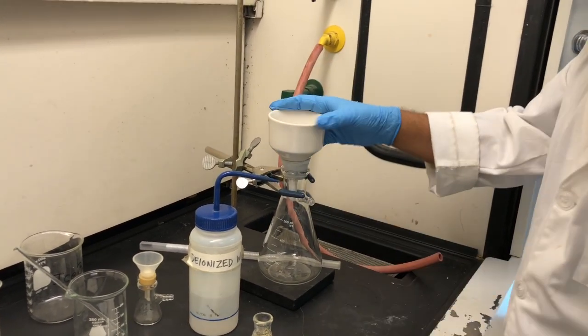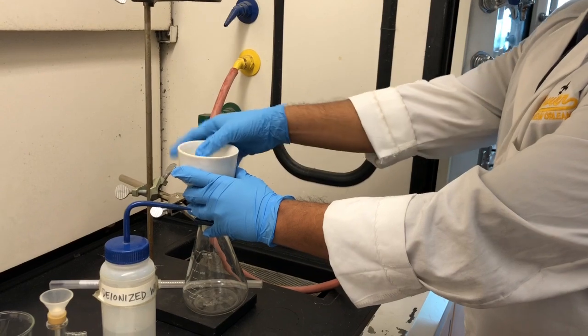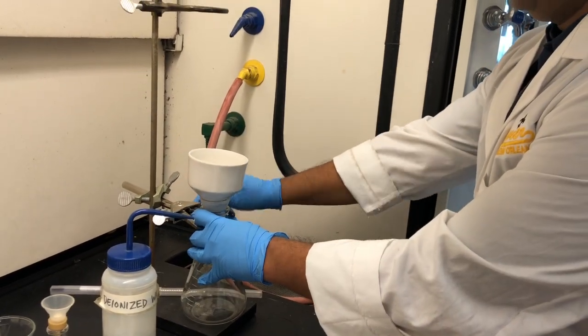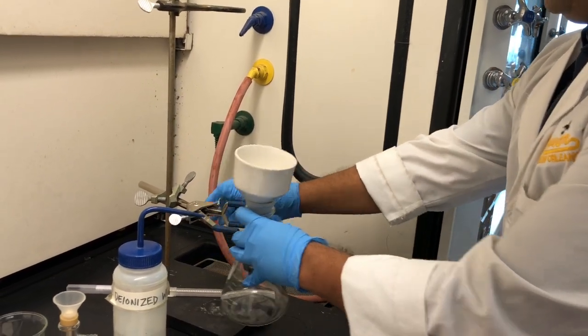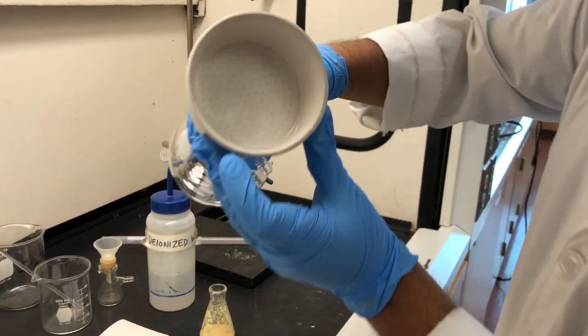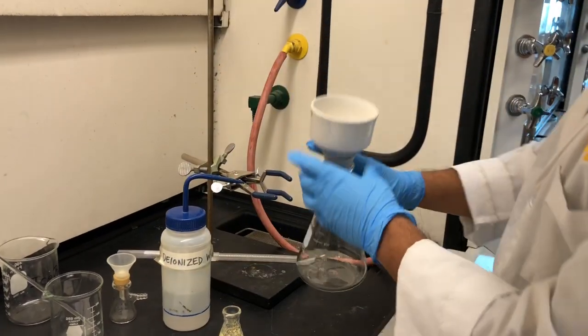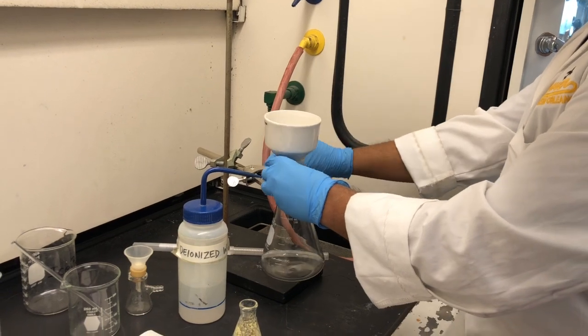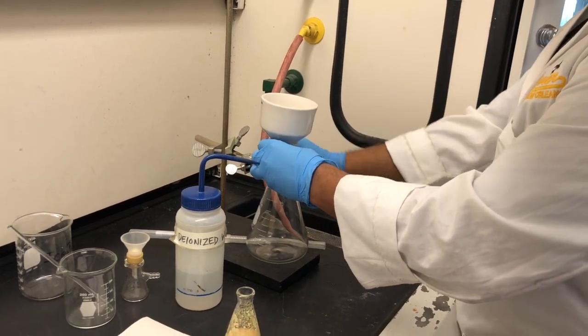Second, you need to make sure the paper covers all the holes of the Bushner flask. You can see that it is covering and it is sticking nicely to the base of the Bushner funnel.